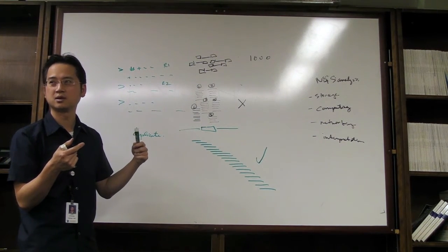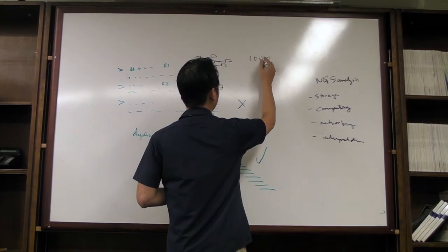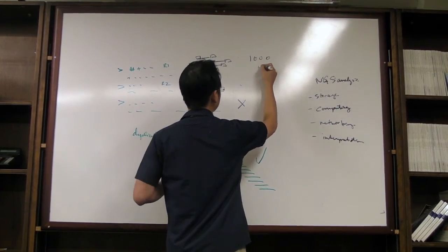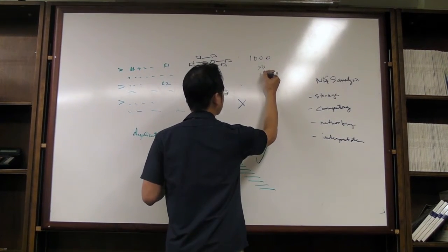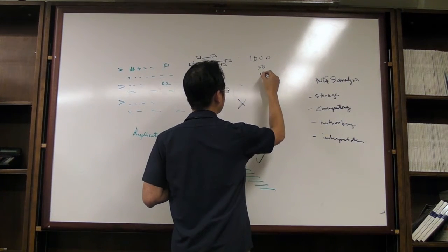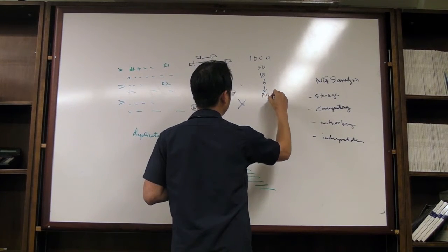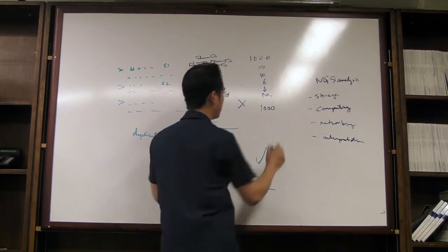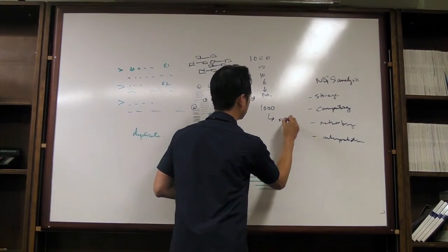Does that make sense? So when you do capture, let's say you start out with 1,000 and you captured 50 of them. And then you do washing, you lost most of them and you were down to say 10 or something like that. And then you lose some more, you're down to 6, and then you do your PCR amplification and it brings it back up to 1,000. And then a subset of this, during sequencing, 500 of them get sequenced, okay?